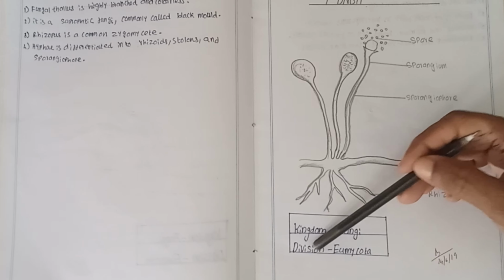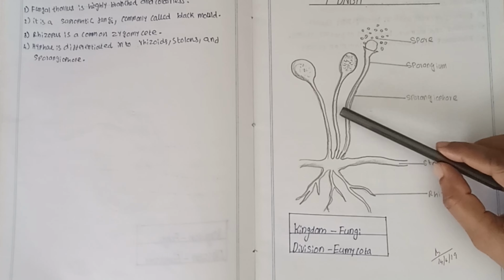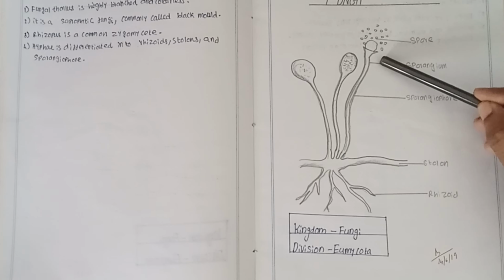Kingdom fungi, division Eumycota. What about the structure of rhizopus? We can see the stolon, rhizoid, sporangiophore with sporangium.